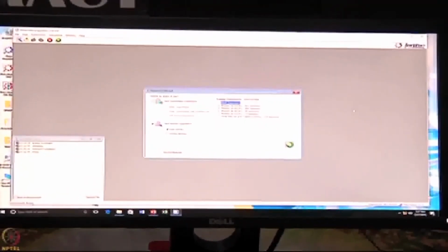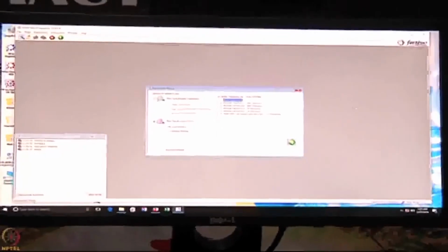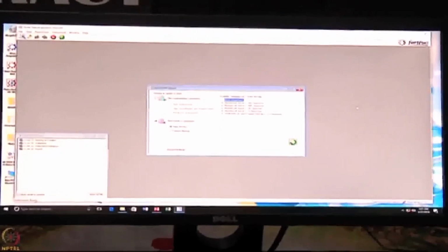Using this, I will take a blank experiment here. There are some inbuilt templates, but the best way is to go for a blank experiment, where you can make your own template format. If you know how to make your experimental design with blank templates, it's very quick. So I will click go here.